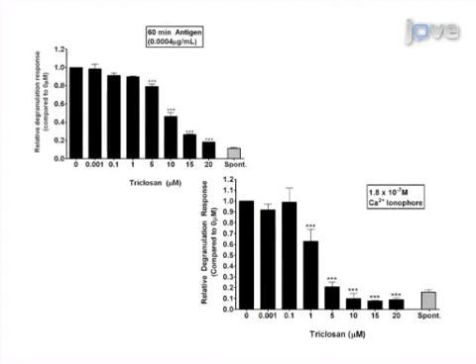Results are obtained that show Triclosan inhibits antigen or calcium ionophore activated degranulation in rat basophilic leukemia mast cells based on a fluorescence-based microplate assay. The main advantage of this technique over earlier methods is that it is an inexpensive, rapid, and highly sensitive alternative.